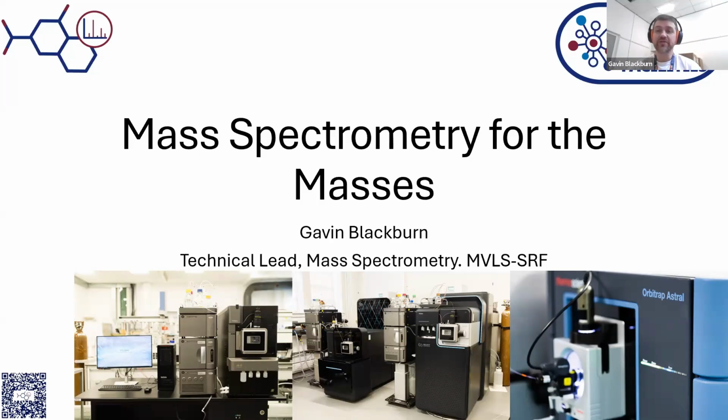You can get the same instruments doing very, very different things depending on which lab they're hosted in. So this talk is going to focus mainly around biological mass spectrometry, the kind of things that we do at the SRF.